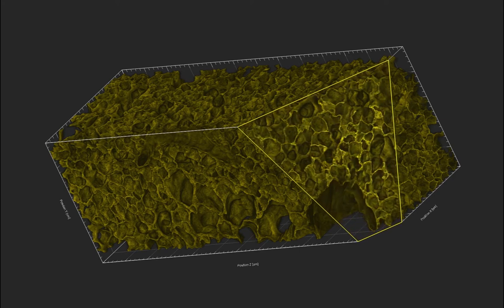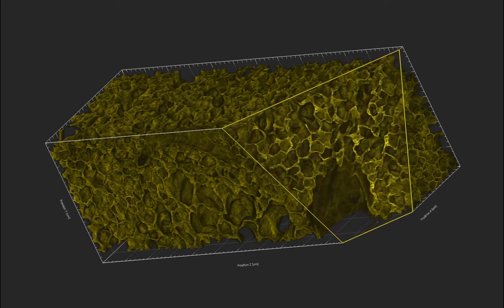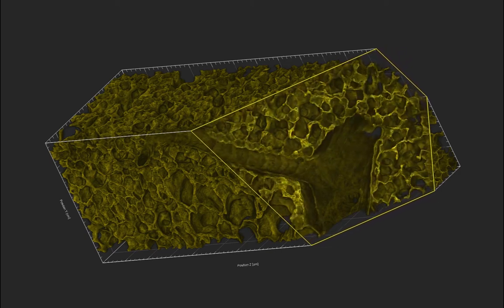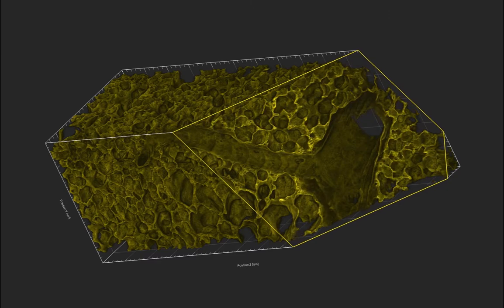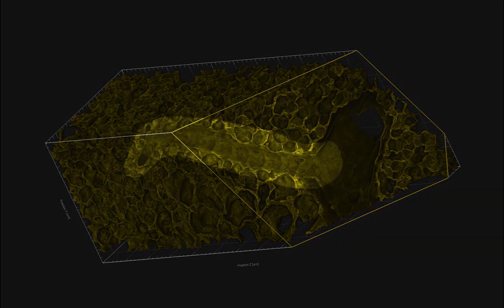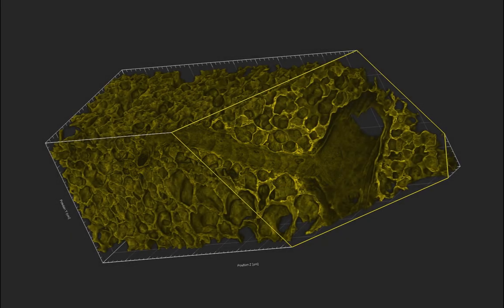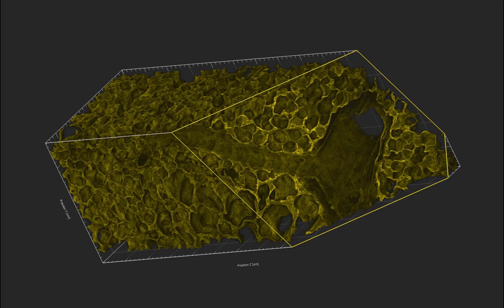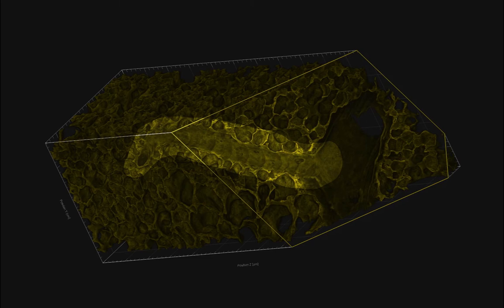So here we can see the pulmonary vein. Here is one of the main pulmonary veins going through the lung, and here is a side branch going off towards the edge of the lung. If you look very carefully, you can see a couple of interesting things that haven't been seen very well before. These little holes here are venules collecting from the pulmonary capillary plexus, bringing oxygenated blood down here and up here through to the heart.